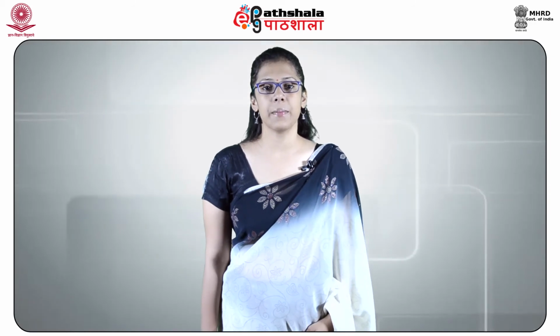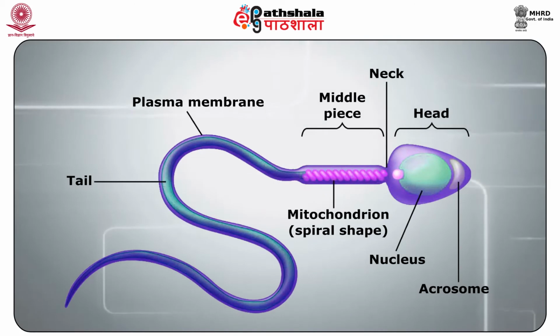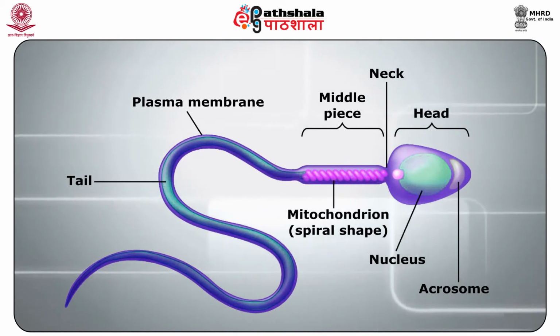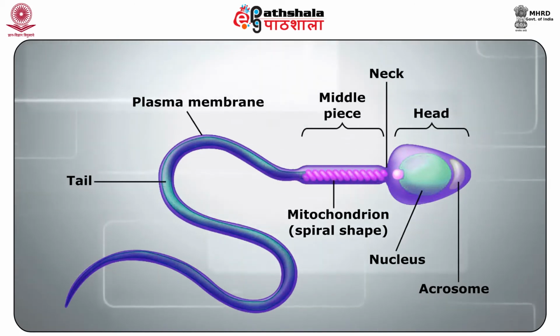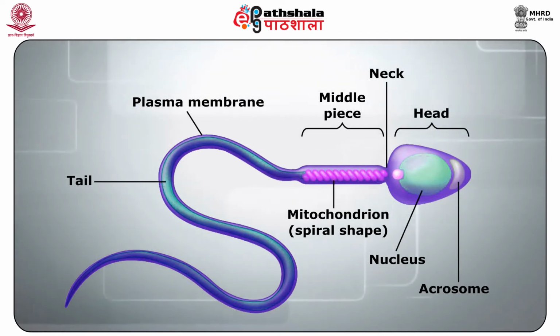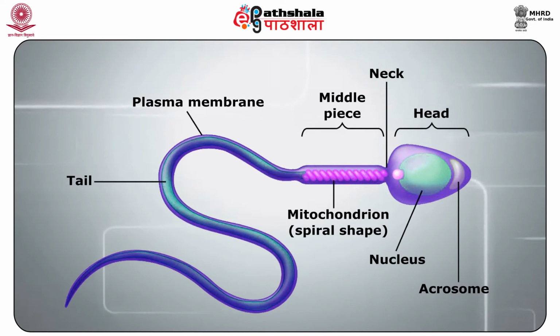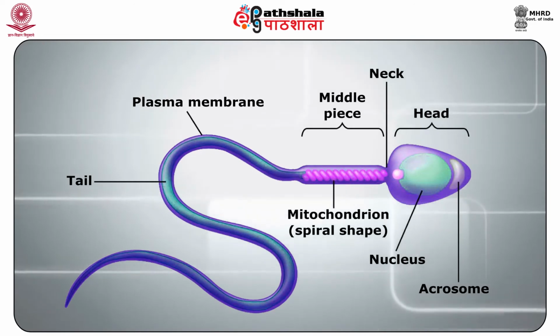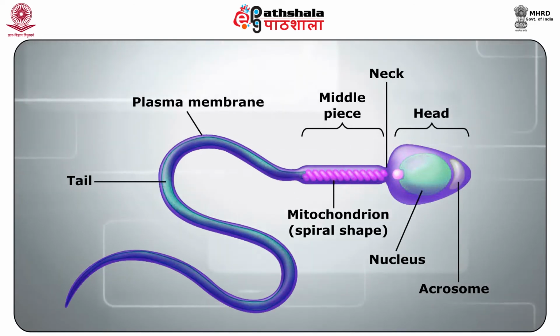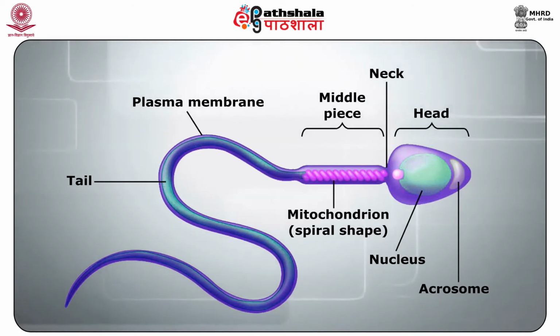Next is the morphology of human spermatozoa. The maturation of cells in seminiferous tubules to mature oval spermatozoa with an acrosomal cap in the ejaculate involves differentiating steps. Some cells will prematurely terminate the process or result in other shapes: tapering heads, pinheads, round heads.